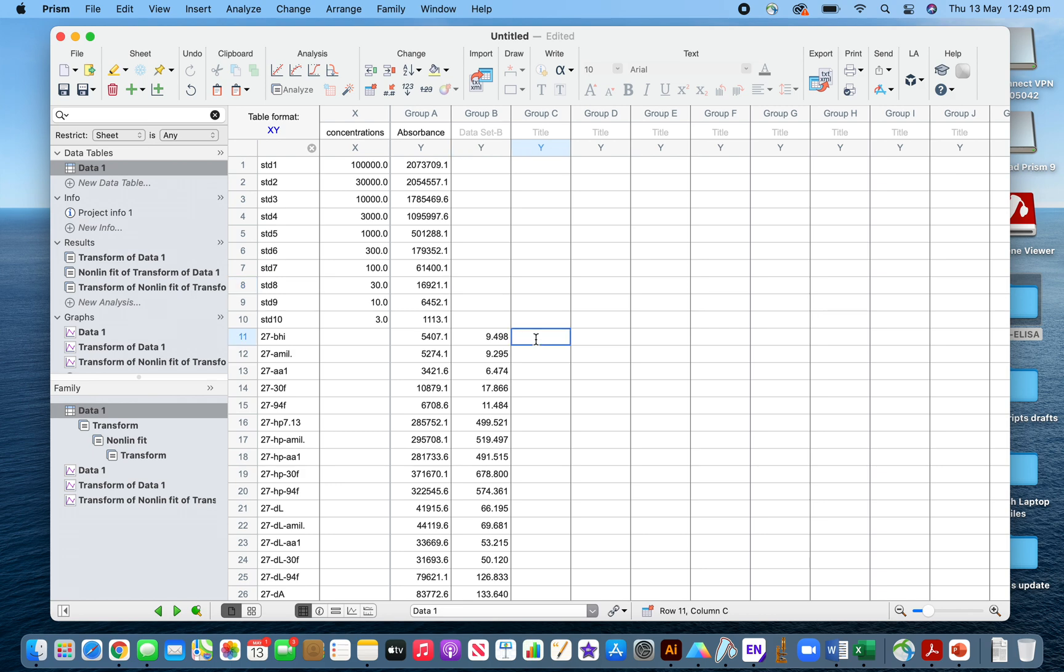After calculating, you'll get the original values. I think this video is helpful for you. Thank you very much.